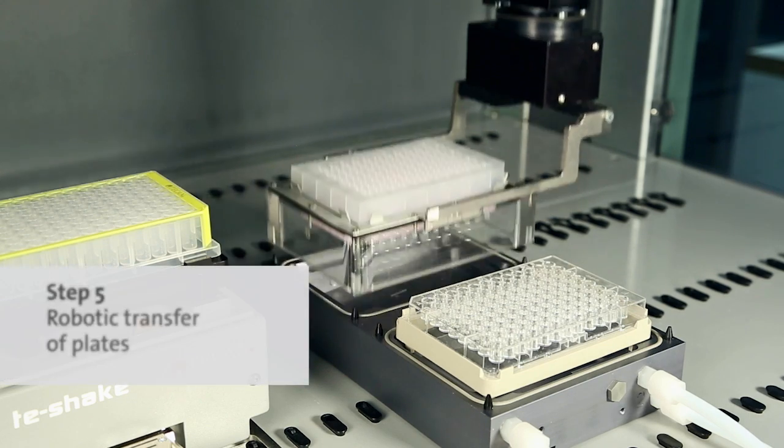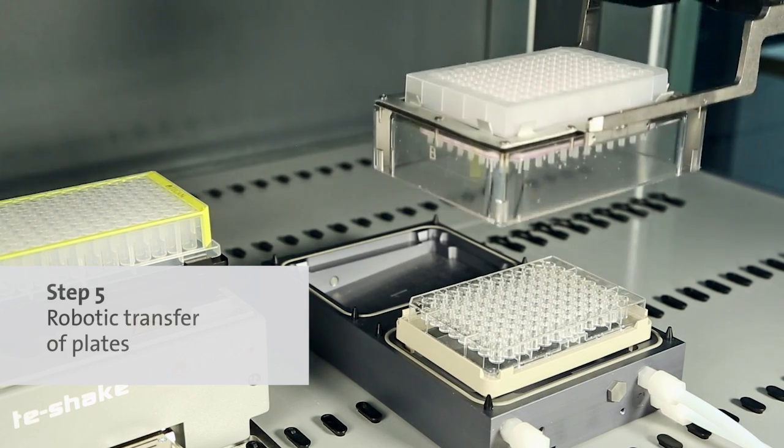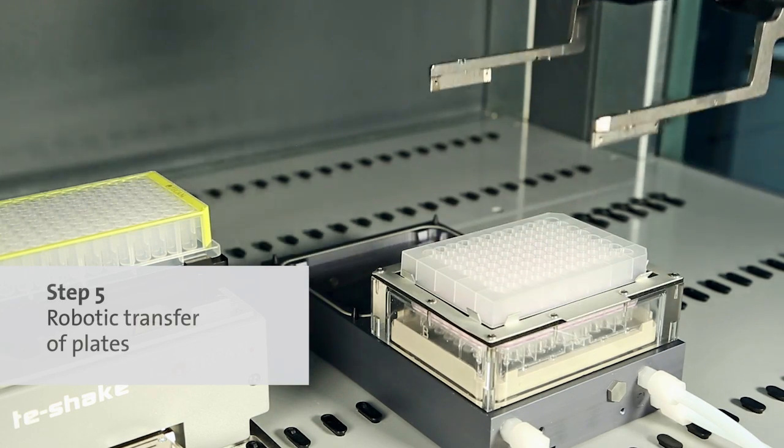A robotic manipulator arm automates more of your workflow, providing true end-to-end process automation.